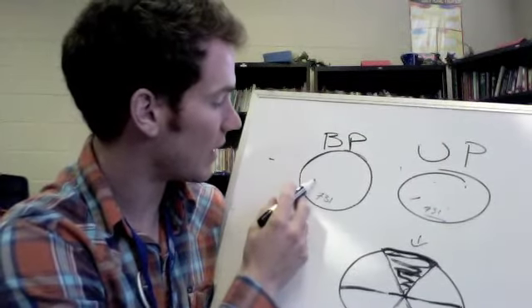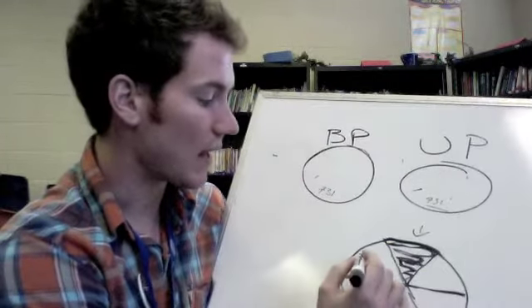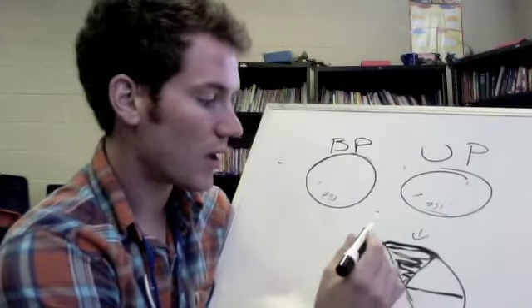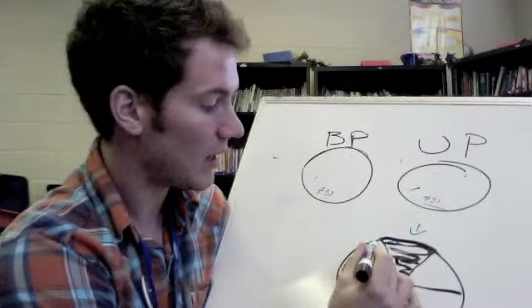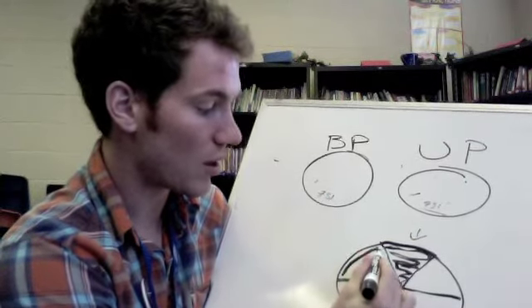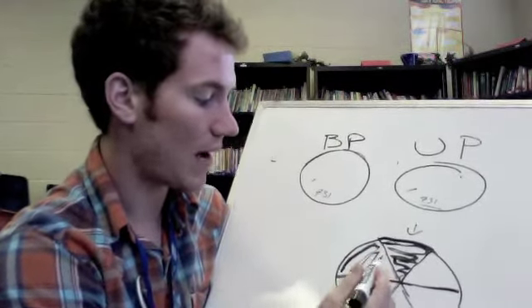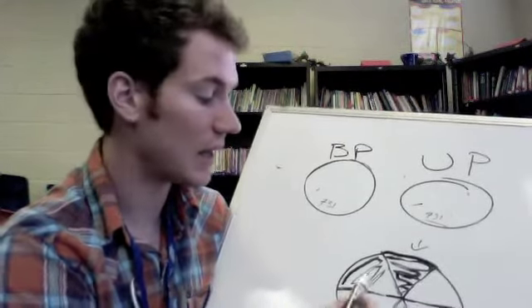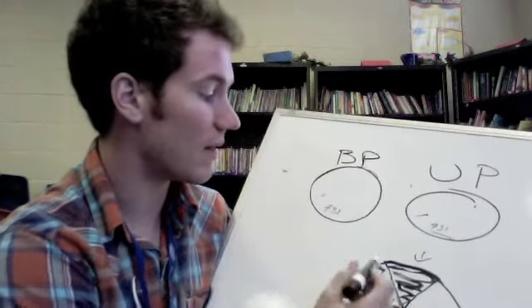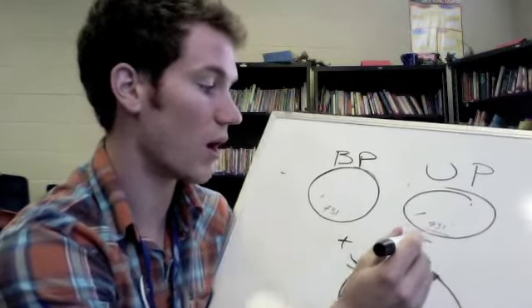Then we'll take a sample from our bait and our prey, and we'll do the same thing. We'll streak it right across the top, switch the side of the stick to a flat side that has no colony on it. We'll drag it from right here, then we'll go back and forth as we normally would. About halfway down, get a new stick, go from here, grab a little bit from there and then go down. Now on this one, obviously, we are hoping for growth. This one, we're not hoping for growth.